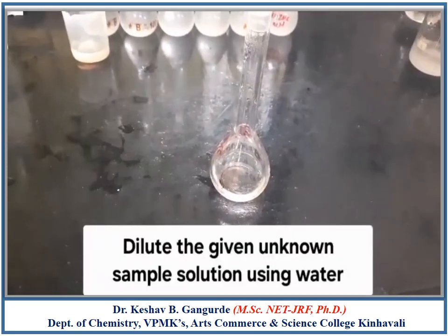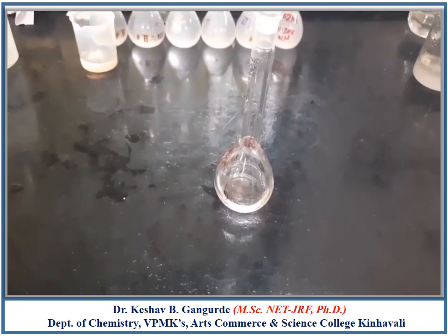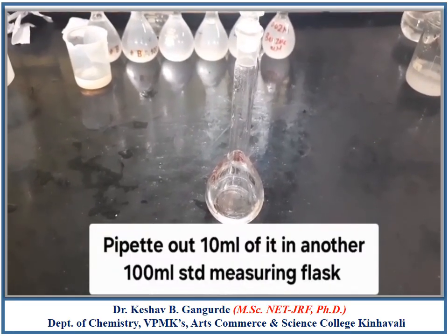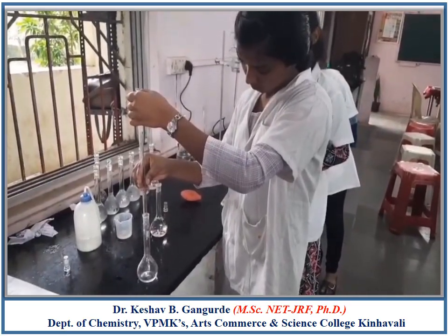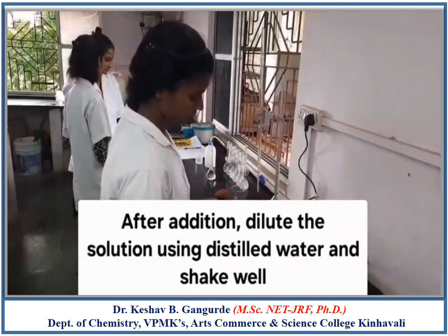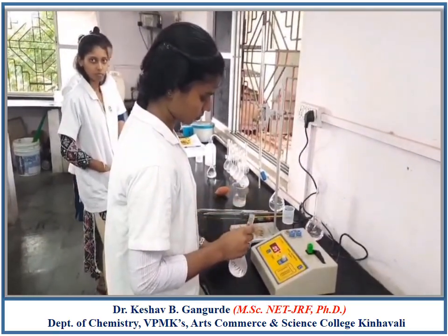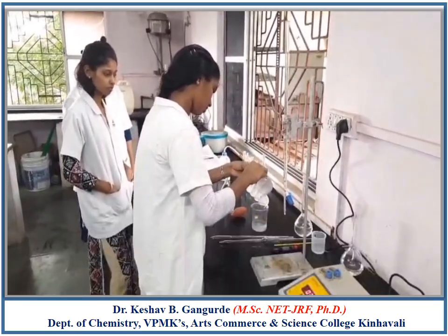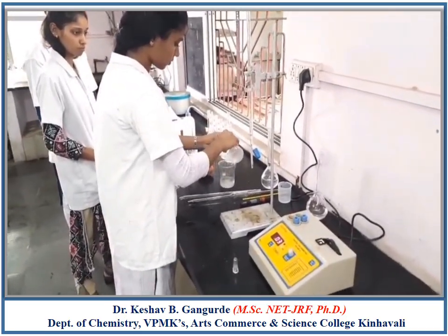You are provided with a standard measuring flask bearing your table number containing an unknown sample solution. Dilute that solution with distilled water up to the mark and pipette out 10 ml for further development. To the 10 ml of unknown sample solution, add 10 ml of acetate buffer and 0.1 g of Barium Chloride, then dilute the flask with distilled water and shake vigorously to get a homogeneous solution.